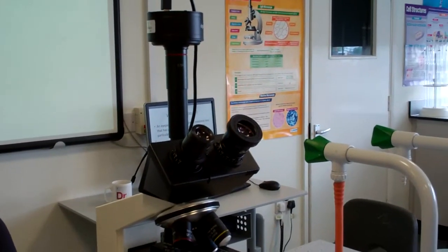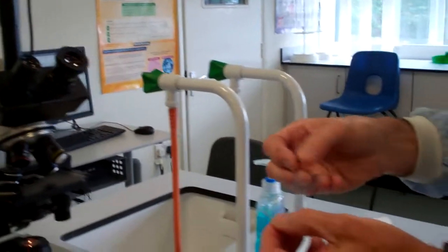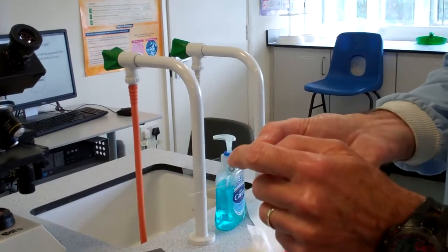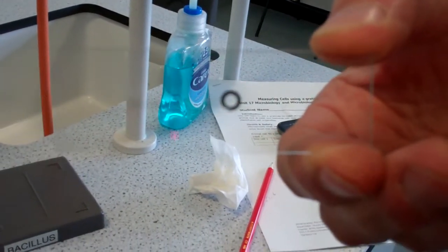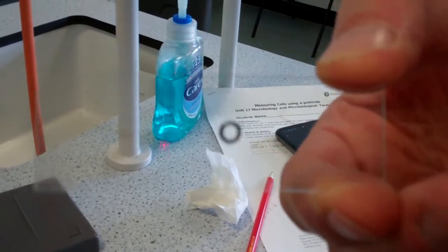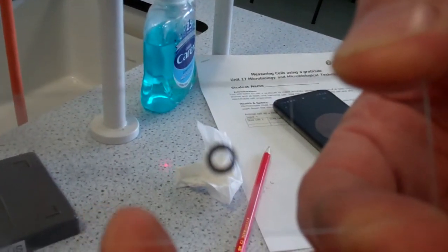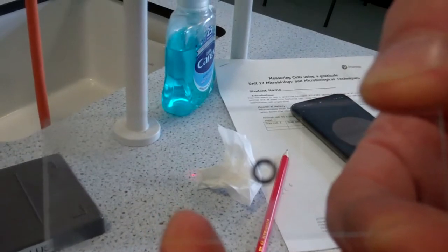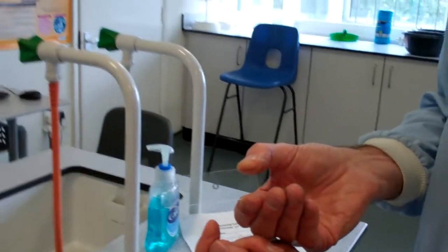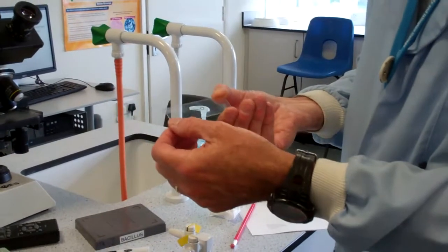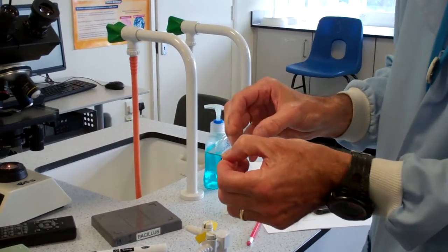We also need to use a special slide called a stage micrometer. Can you see the circular ring? It's got laser cut divisions which are 0.01 millimeters apart for each division. 0.01 millimeter is also known as 10 micrometers, which is a standard unit of measurement when looking at cells.